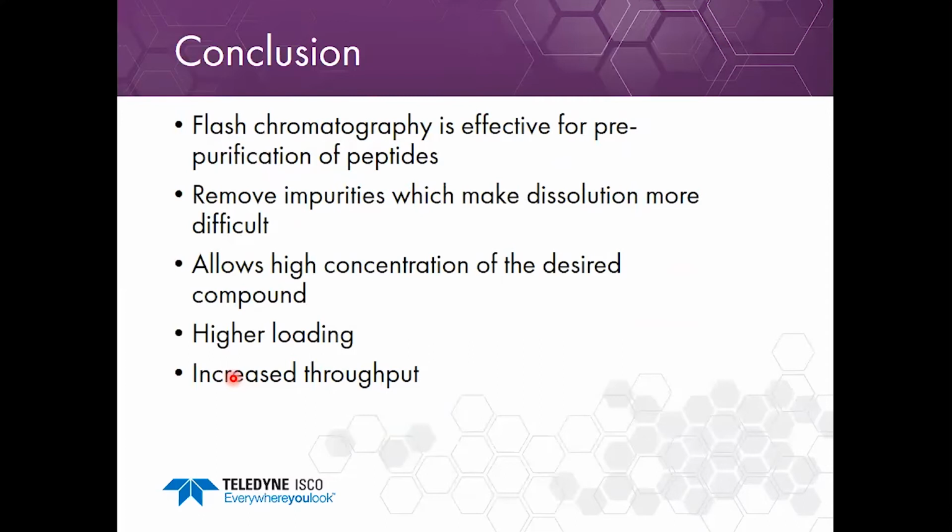Flash chromatography is very effective for pre-purification because it removes the impurities that make dissolution more difficult. It increases the concentration of the desired compound and allows a higher loading, which in turn allows increased throughput.